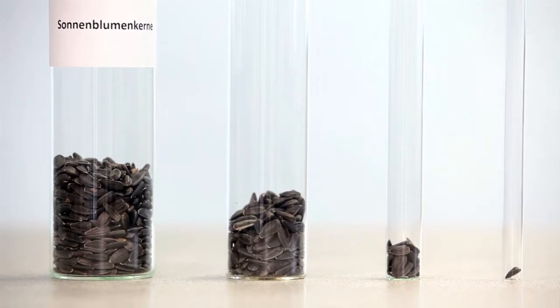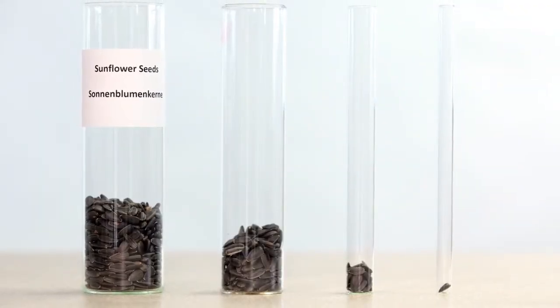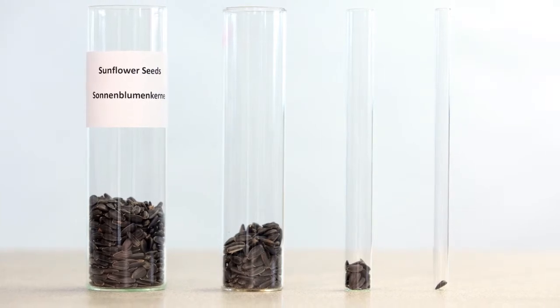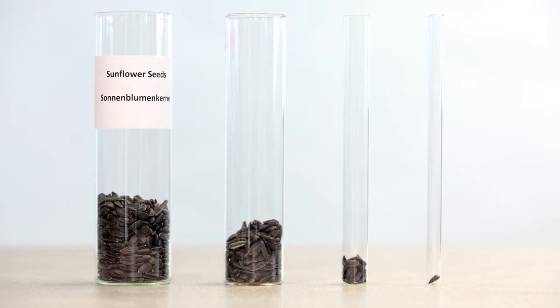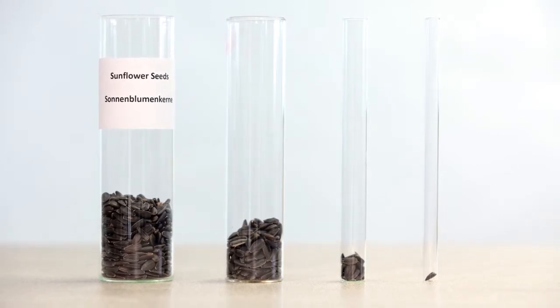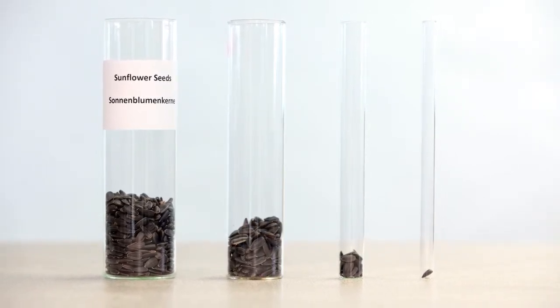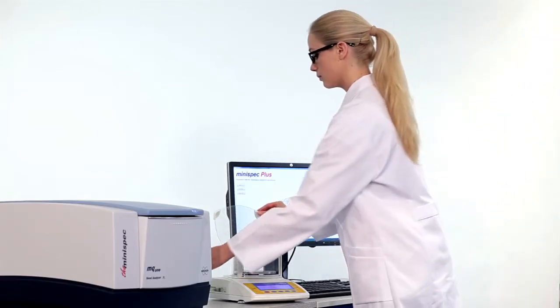Even small single seeds can be analyzed. For bulk analyses of inhomogeneous samples, use large sample volumes. Sample volumes up to 100 milliliters can be investigated. The seeds are measured as they arrive from the farm.